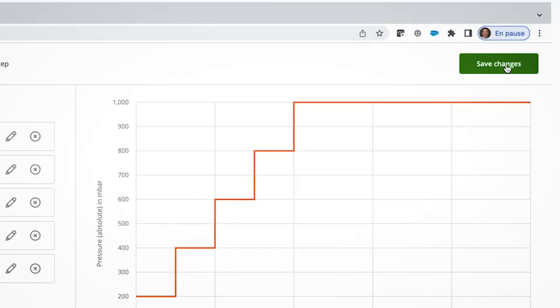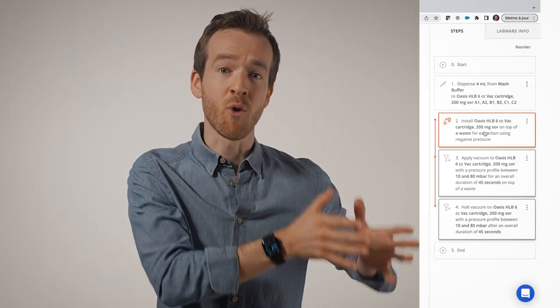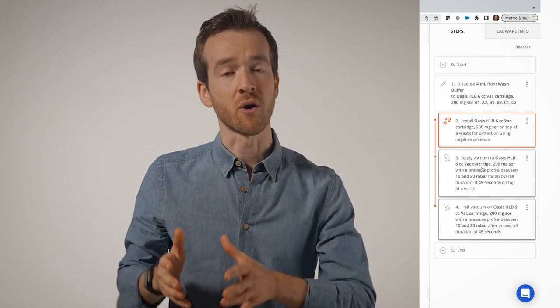Once you're done, click on Save Changes on the top right. OneLab then generates a three-part sequence with an initial labware placement step followed by a start and a stop.